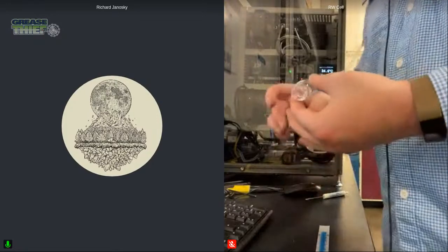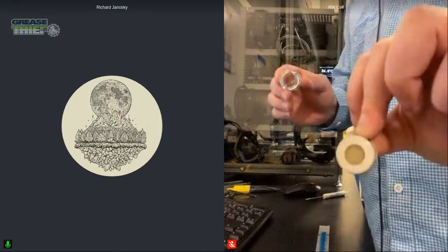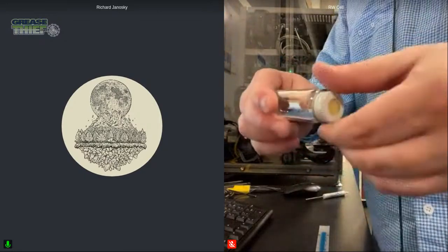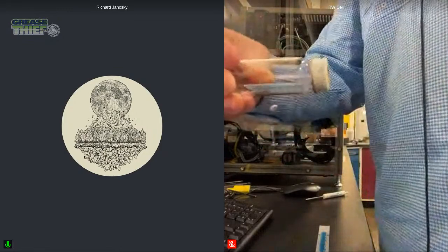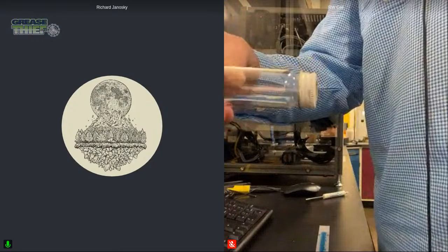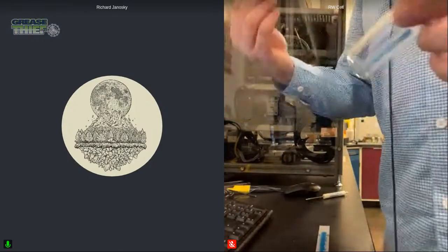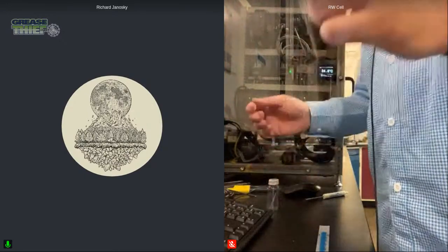So then the next thing I would do is take my cap here. It's got a septum in it, and I'm going to cover that. And now we're ready for our moisture analysis. And as you saw right there, it's really, really easy. And then we would perform the same thing.